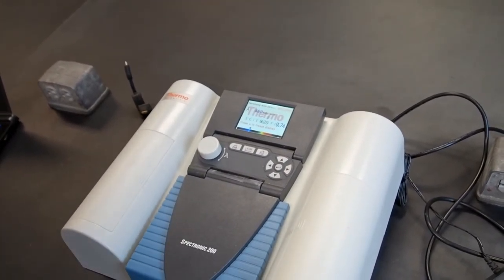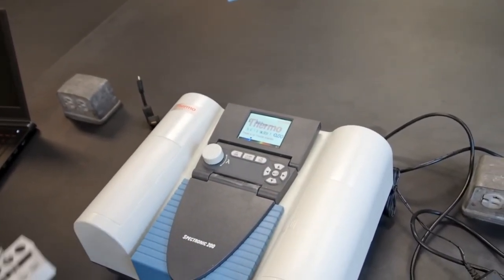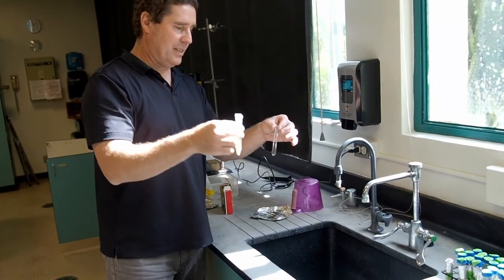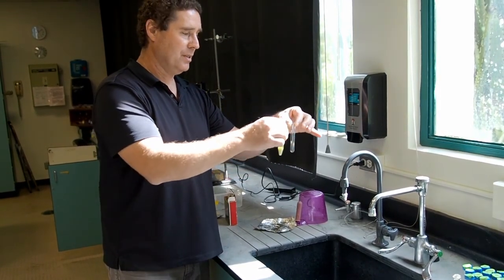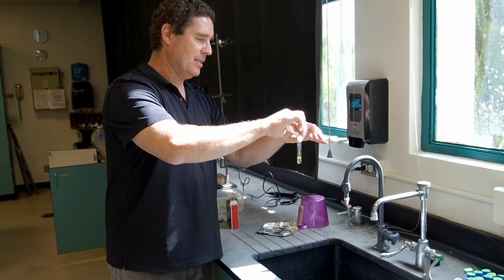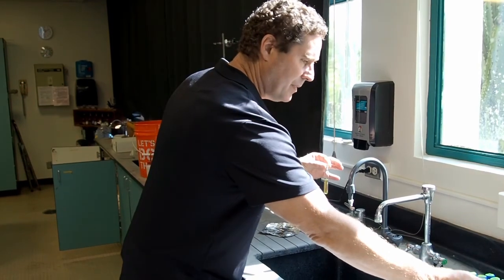We can compare that to our sample containing our seawater and chlorophyll. Acetone containing chlorophyll. Here's our centrifuged sample. I'm handling the cuvette at the top so I don't get grease or oil from my fingers on it. We're going to carefully decant this. We need the bottom to be filled. And there's our sample we're going to put in our spectrophotometer.